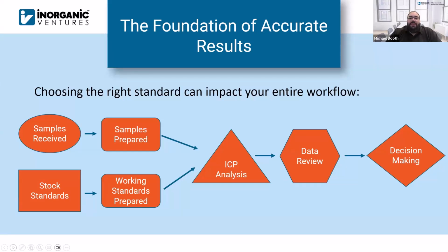All right, so why is selecting the right standard so critical? It's basically because it's the foundation of your whole analysis. You have all of these things that impact the accuracy of your results, and a big part of that is the standards. If you choose the right standards, it can also have an impact on your sample preparation. There are a few options that a lot of people don't think about in terms of the best standard for your specific application. Try to keep all of these steps in your workflow in mind.